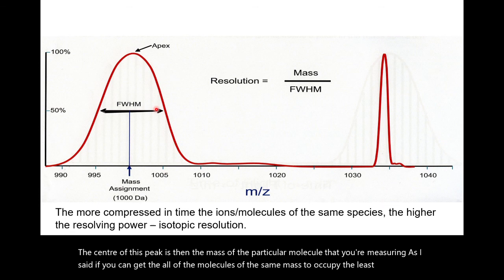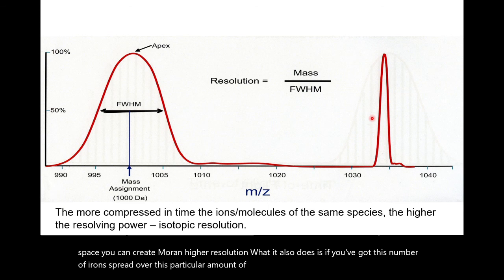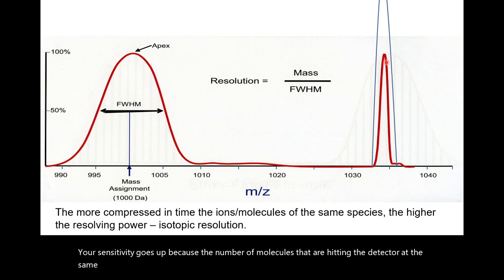What it also does is, if you've got this number of ions spread over this particular amount of time, and you compress them into this amount of space, your sensitivity goes up, because the number of molecules that are hitting the detector at the same time is increased. So you're increasing your level of sensitivity.